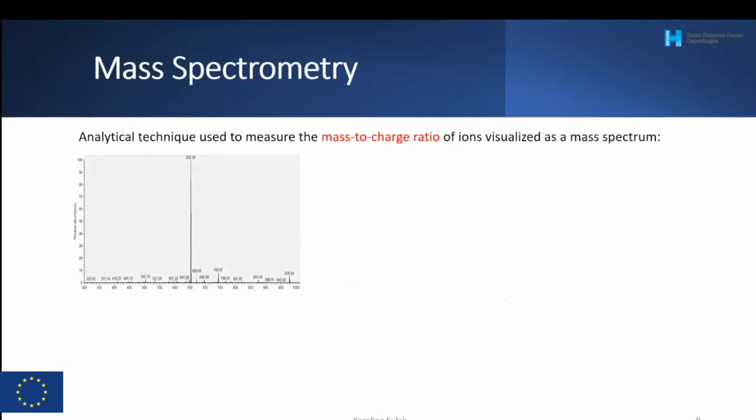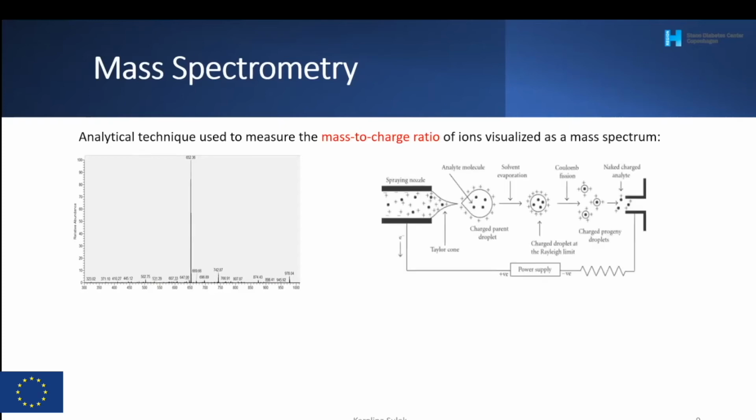So this is how it looks when you open the file and have a look at the mass of a specific molecule: the mass is 652.36. I know, not extremely impressive, even if you think about laser microscopy or something, but actually this provides quite a lot of nice information.